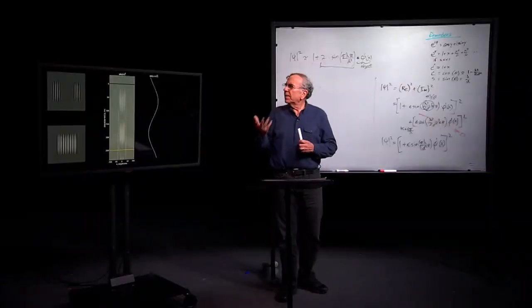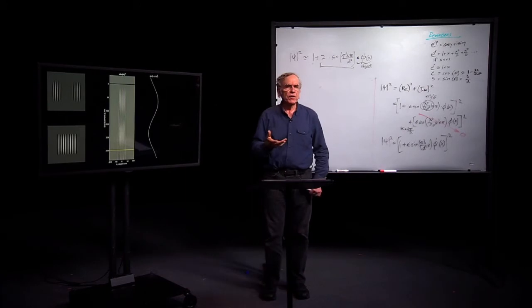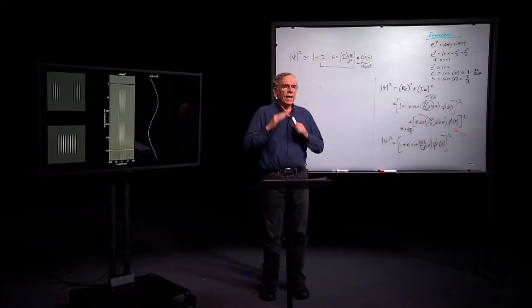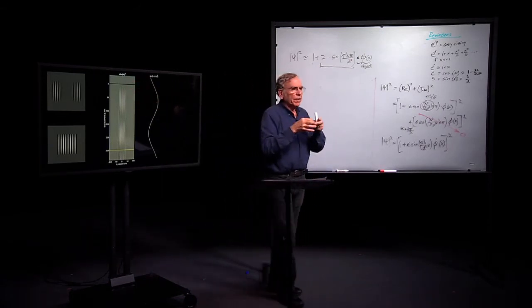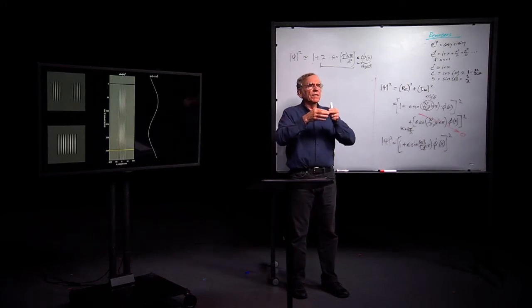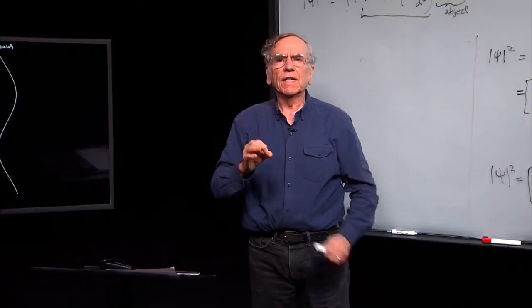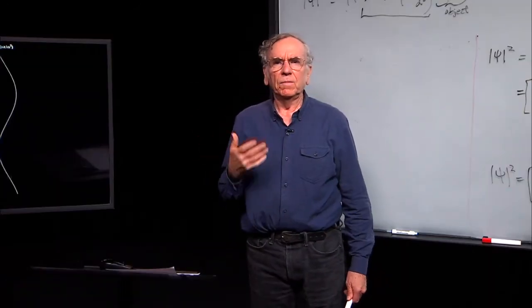Okay, so we have now thought about how contrast changes as a function of distance above and below the specimen. And this is all we need to know, because if we had a perfect objective lens on our microscope, all we have to do is to focus somewhere either above or below the specimen, and we will get some contrast as the electron waves interfere with one another.